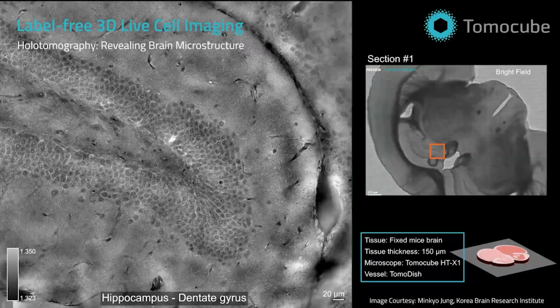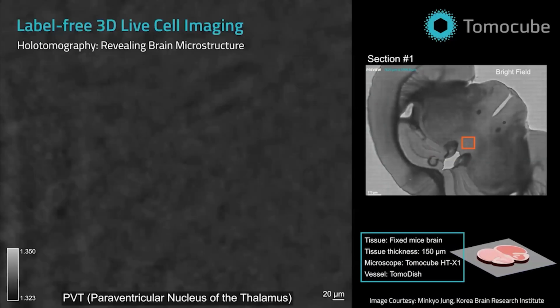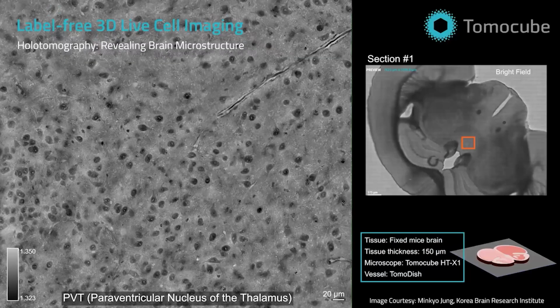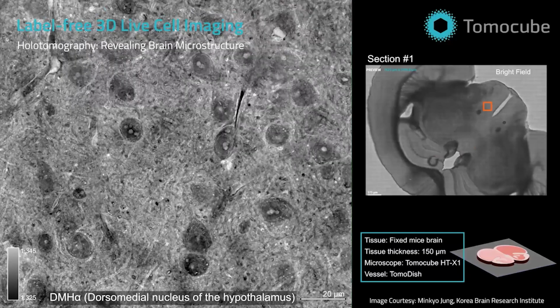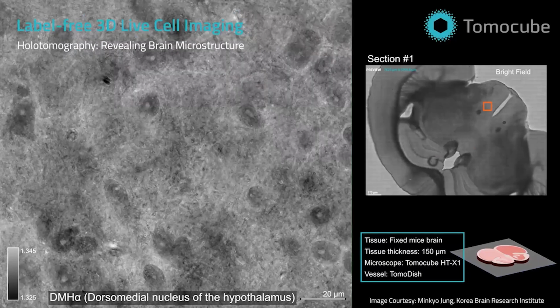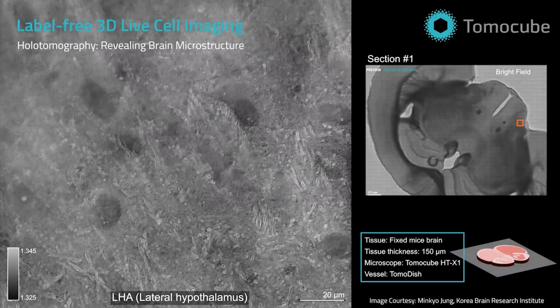We can also measure thick tissues. So this is the mouse brain. But fixation is optional. You can also measure fresh tissues because we do not use any labeling agent. But the important thing is the thickness is about 150 micrometer. In conventional histopathological practice, they do fixation and sectioning, followed by some embedding and stuff like that.